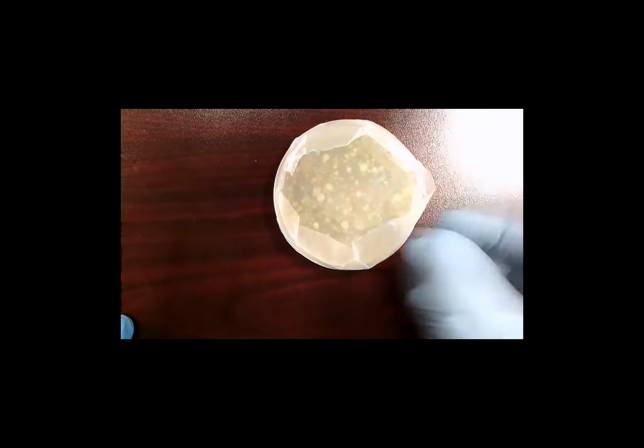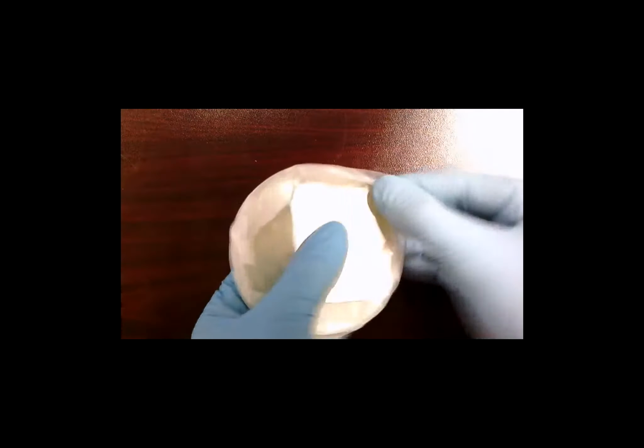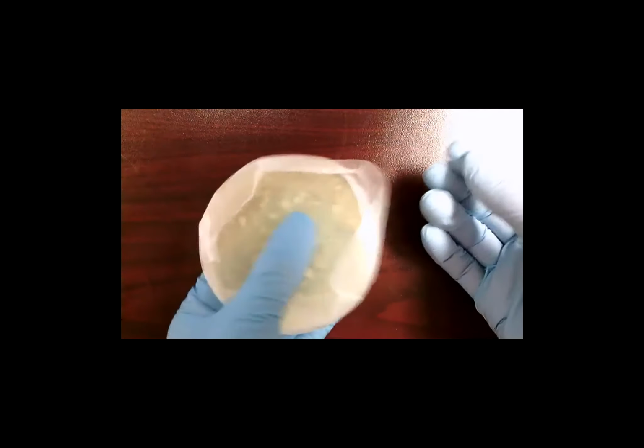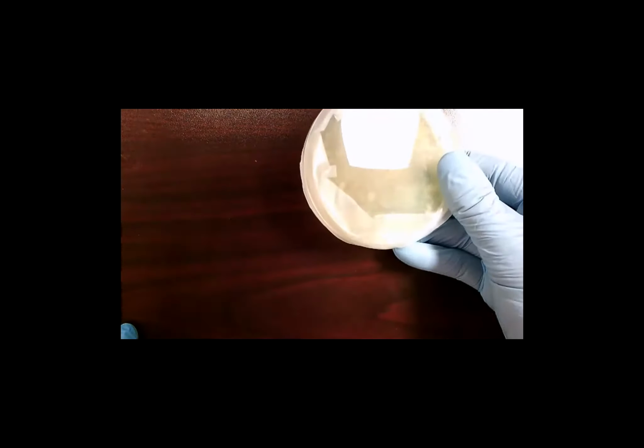A couple things can happen. They may apply more pressure with a thumb and crack it and cause exposure, or over time they may unwrap it, and then if it's dropped, we could have potential exposure. So we will try to make sure that the tape or parafilm is pushed back as much as possible.